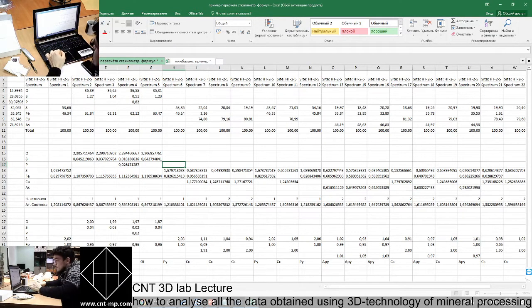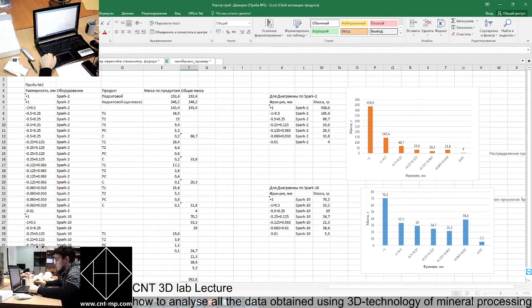But in this particular case, with the probes disaggregated, wet sieved, hydroseparated and hand-picked by us, this is just a simple approach to receive special products, actually sulfides, and we made a special list or registry of each product we received.